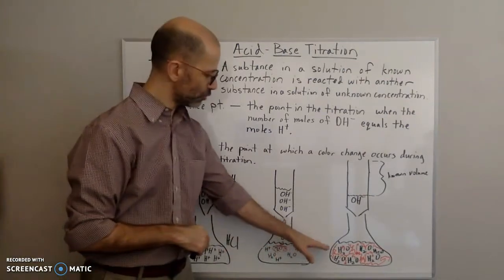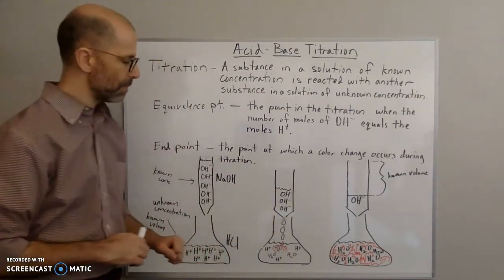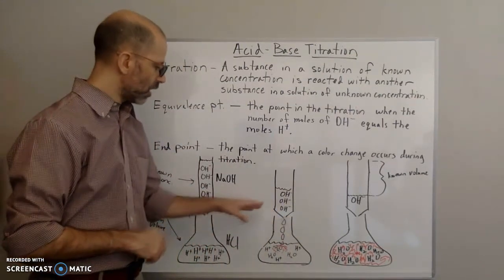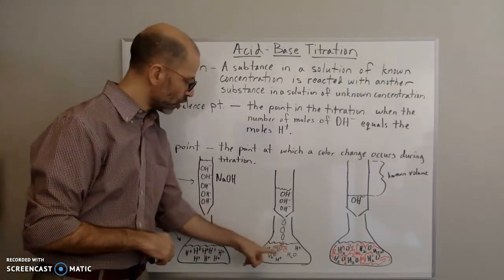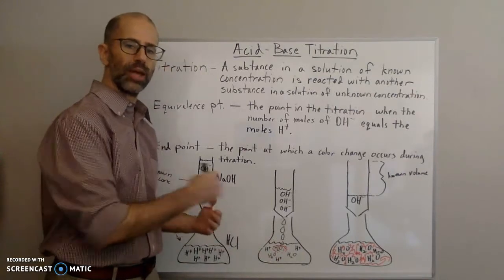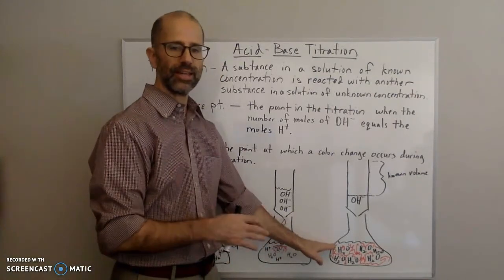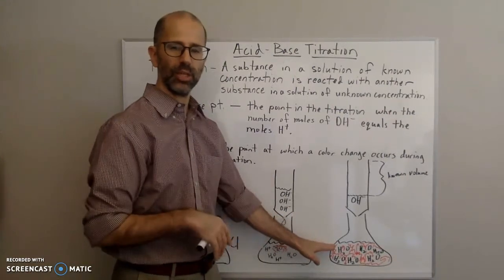And I try to write this here, but it's pretty pink or red down here, so that's the best I can do. So here you're close, but the pink goes away. So if the pink goes away, you've got to keep going. And then you get to the point where the pink color stays for at least 15 to 20 seconds.